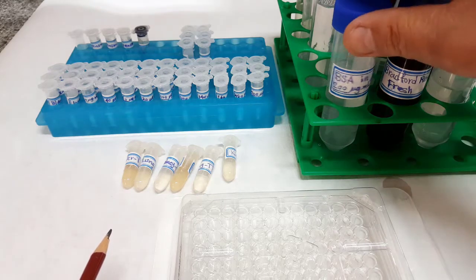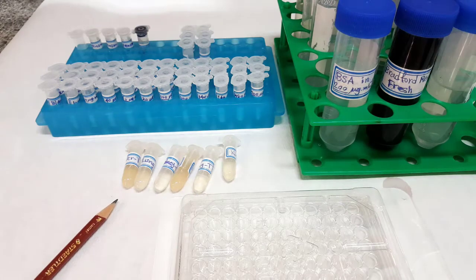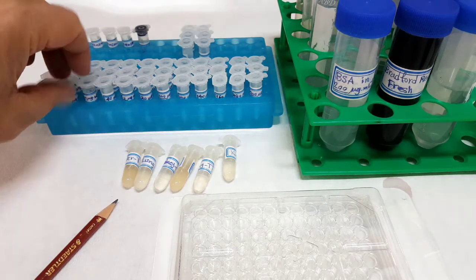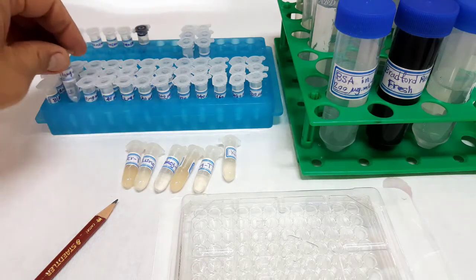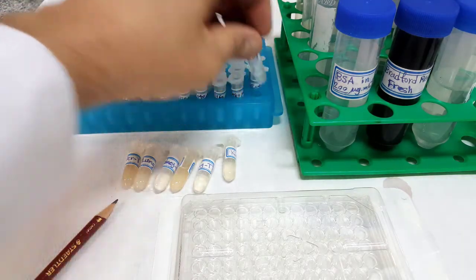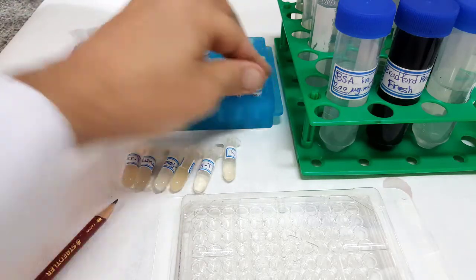A 200 micrograms per milliliter BSA stock solution is prepared, from which 10 to 200 micrograms per milliliter BSA working solutions are prepared in triplicate.